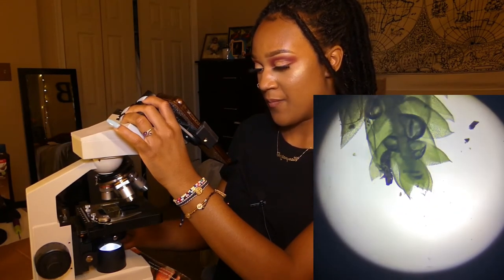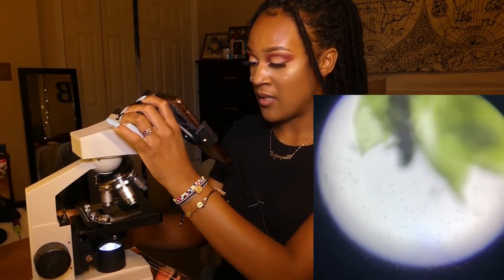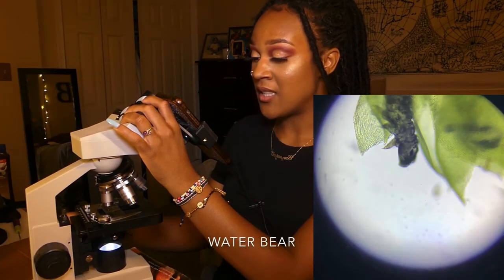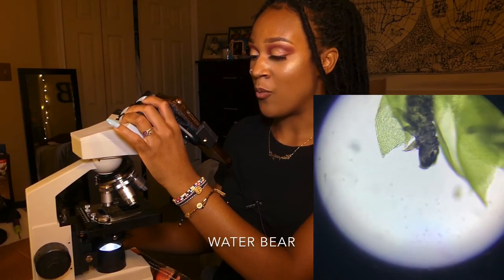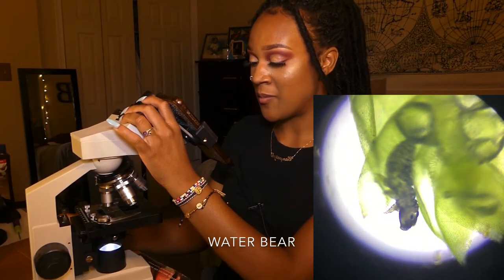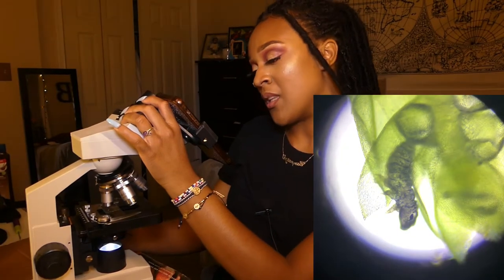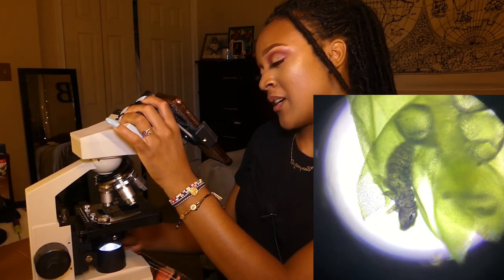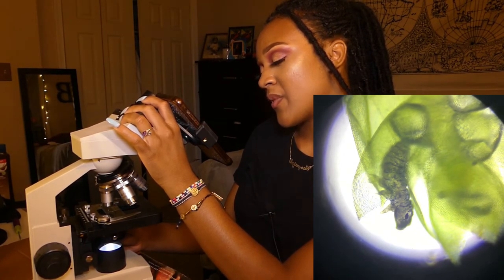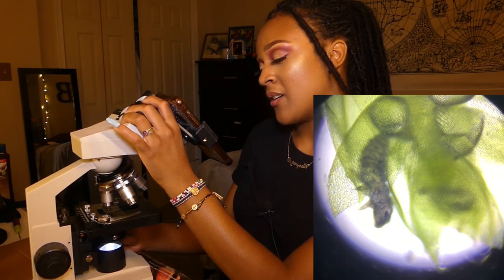What is that? Is it real? What is that? That looks like a water bear. So I see the black thing. I think it's stuck because of the cover slip. Well, look at it. The black thing must be the eye. It still looks alive. Still kind of moving. I wish I could pick up the cover slip, but I don't want to disrupt it.